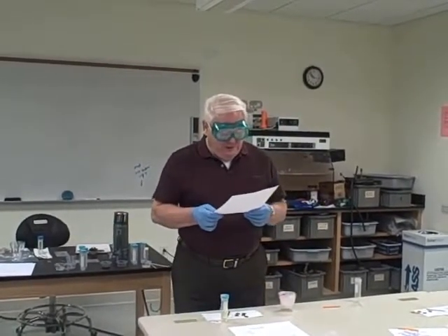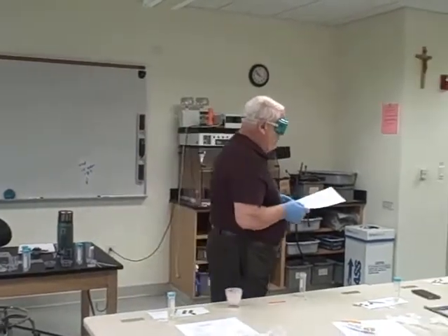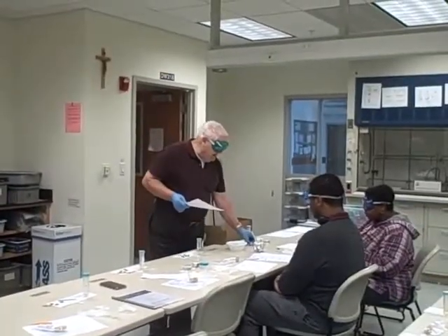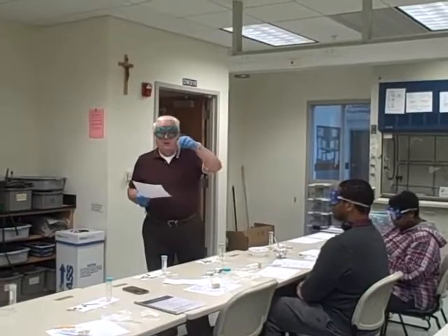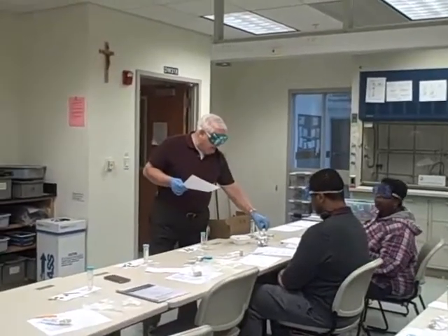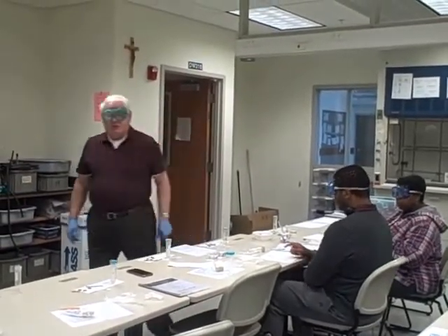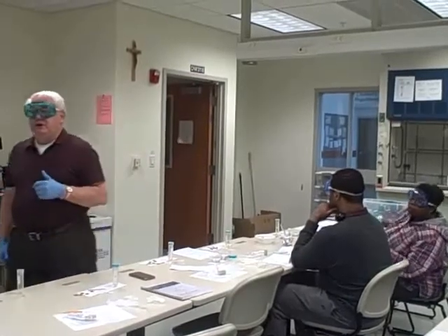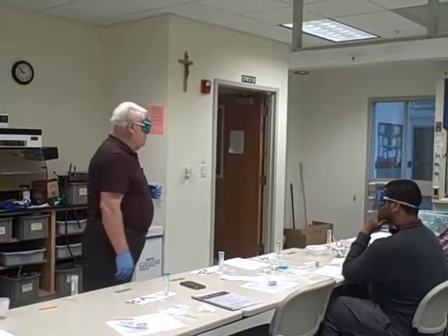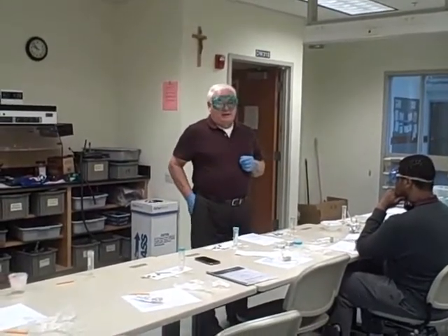All right, the first thing we're going to do with experiment number 4 is a group experiment. We have a 10 mil tube with copper sulfate in it. Now, this is something that's on your errata sheet. We were supposed to have put a little bit of regular table salt into that copper sulfate as we were putting together the materials on GAC day.